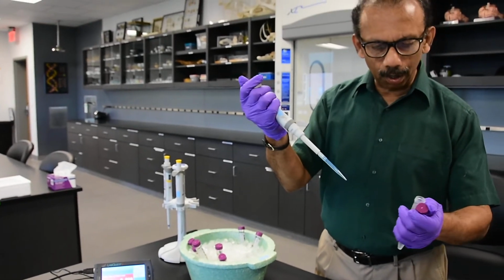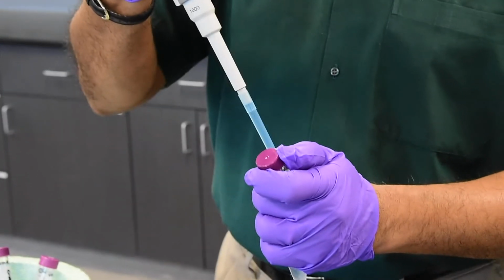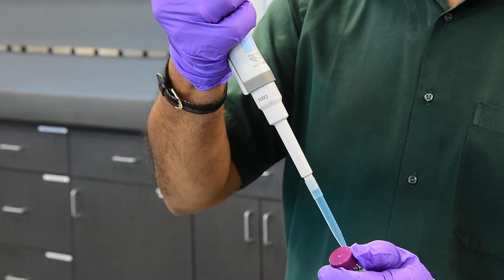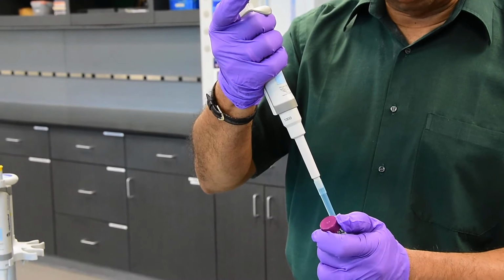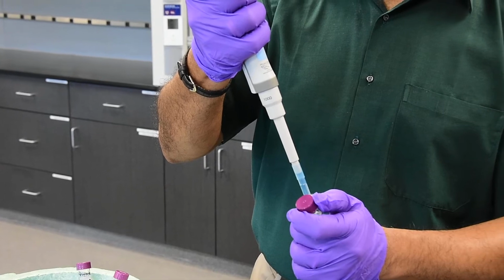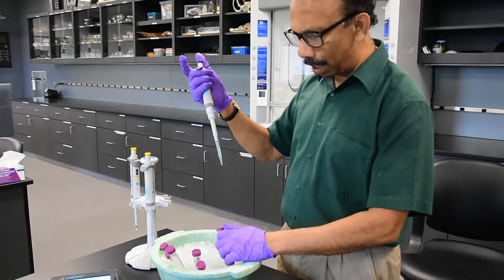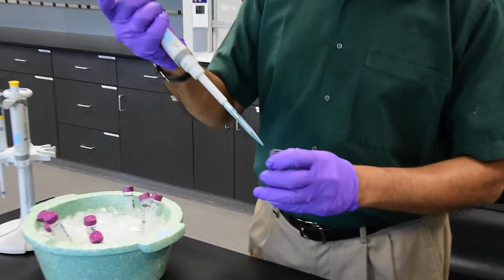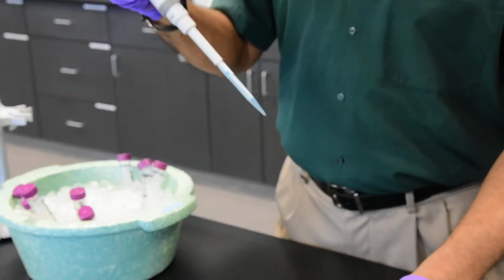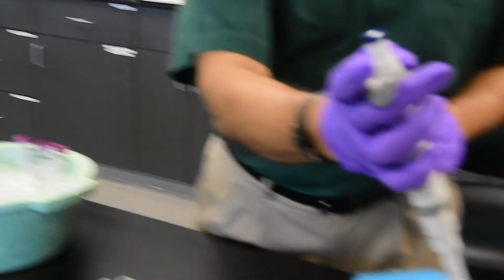So here's a micropipetter. Here's the glucose. You want to make sure you're adding the right amount, and also you don't want to release this in a jerky motion because it will take air in. So I'm going to do this very gradually, and the liquid, 1 milliliter, is taken in. So now I put the glucose back on the ice, and now I'm going to add it to this first dilution, and I have 1 milliliter of glucose. So to this, I'm now going to eject this tip, and I can use this button to eject it into a waste beaker.